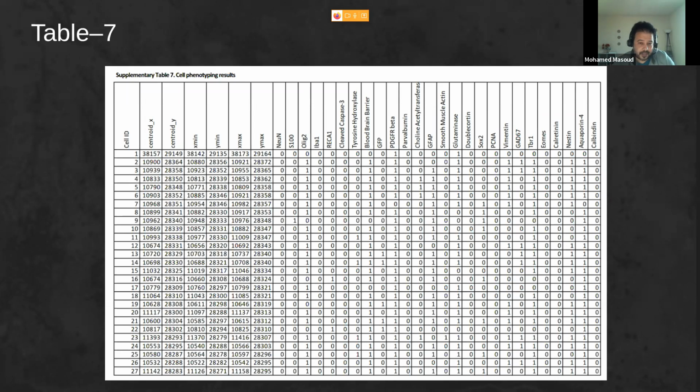Each cell has a location based on its X and Y in the tissue, and an indication of the biomarker it has. Based on the unique biomarker, or the combination of biomarkers it has, we can classify the cell.